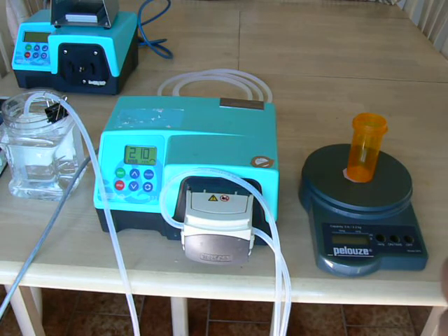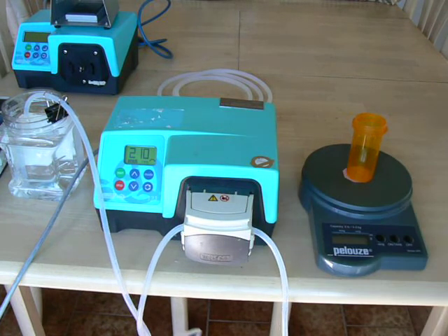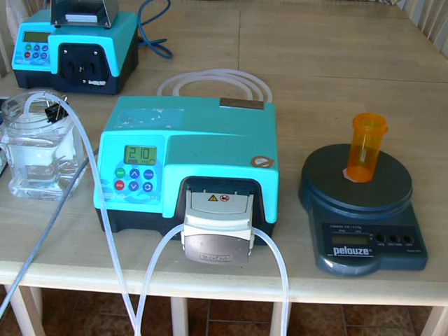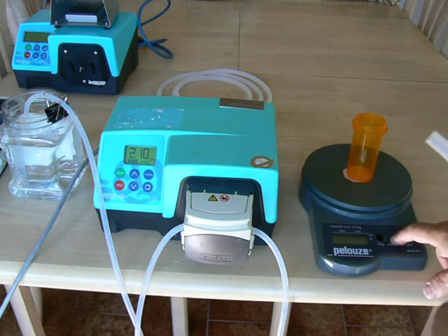The 323 pump has a feature built in called MemoDose. It's a way to do repeated dispensing when accuracy is not the primary requirement. This is not meant to be a filling or dispensing pump, but for repeated laboratory dosing, this function is built in. Let me show you briefly how it works.